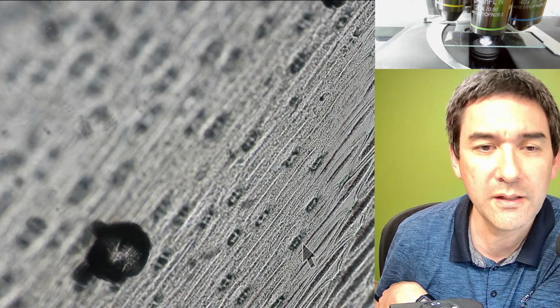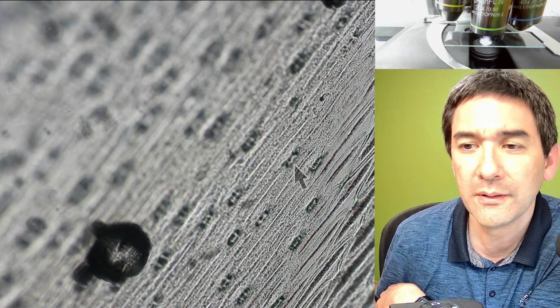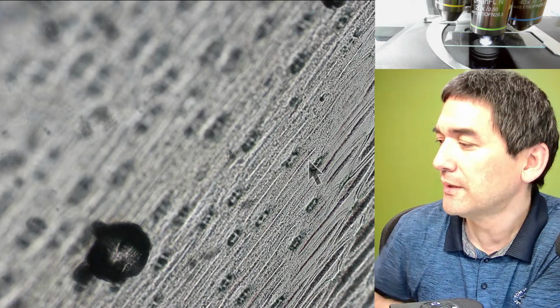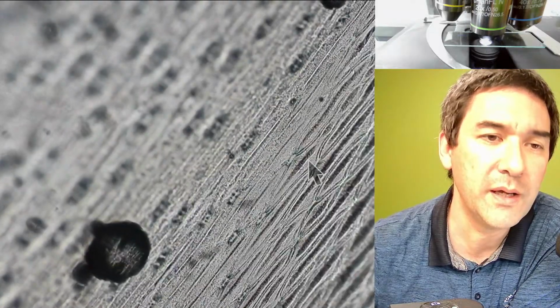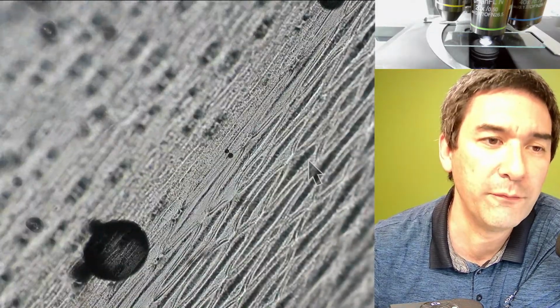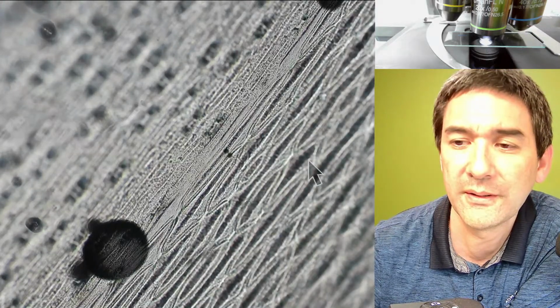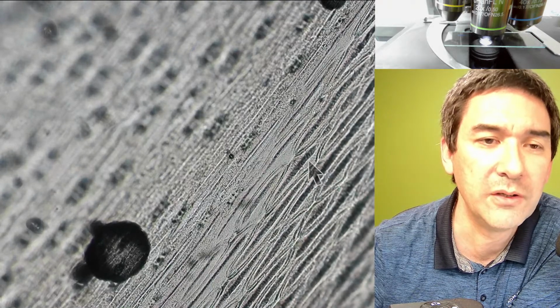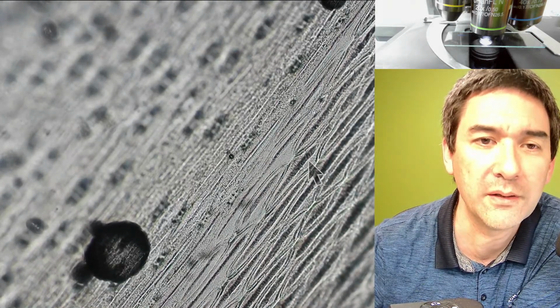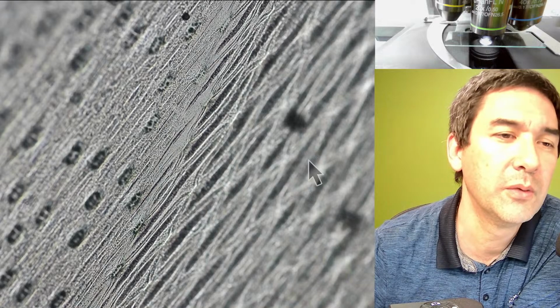Stomata, yes. These are the openings on the bottom of the leaf that allow gas exchange to happen. So this is something that we're also able to see here in a monocot plant like the onion. The reason why, you see it's not flat. That's why when I'm focusing, then some areas go into focus, others go out of focus. The guard cells are basically those that are to the left and to the right of the openings in the leaves, the stomata. And here we see them again.